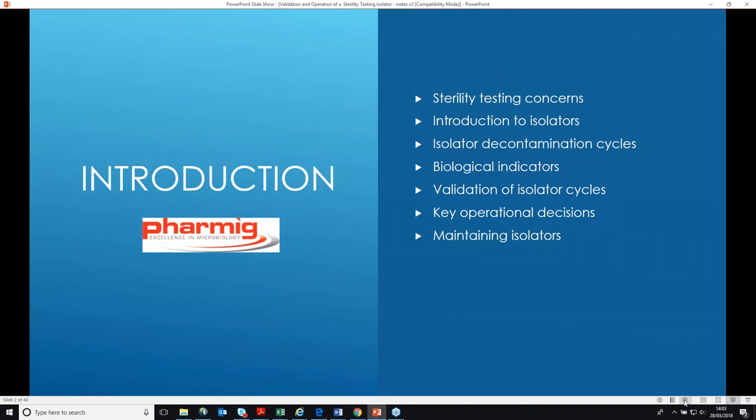Okay, so what we're going to be covering in the webinar today is a little bit about sterility testing concerns, an introduction to isolators, a review of isolator decontamination cycles, biological indicators, key operational decisions, and some information about maintaining isolators. If there is any time for questions and you have any questions, please can you enter them in the chat function on the webinar.